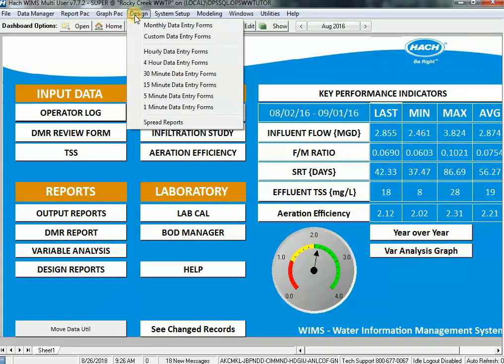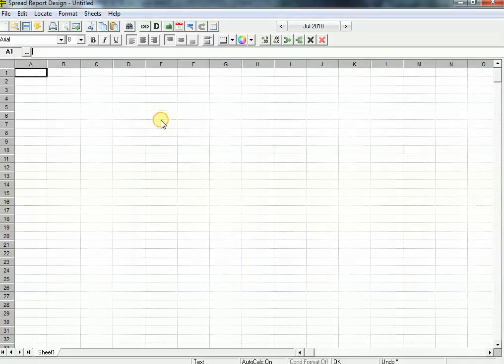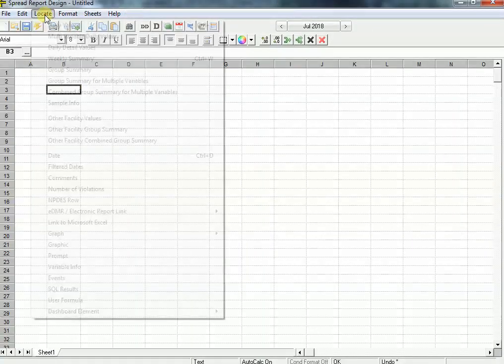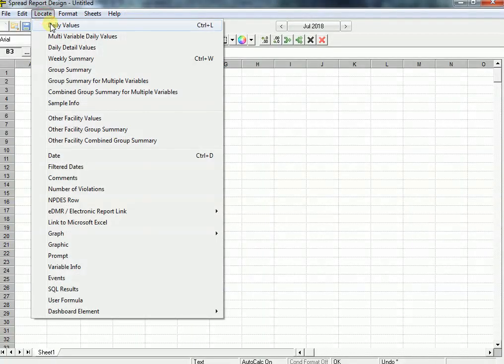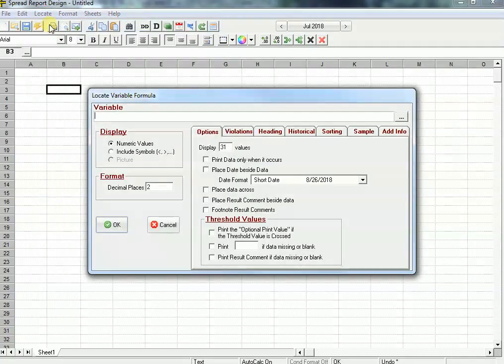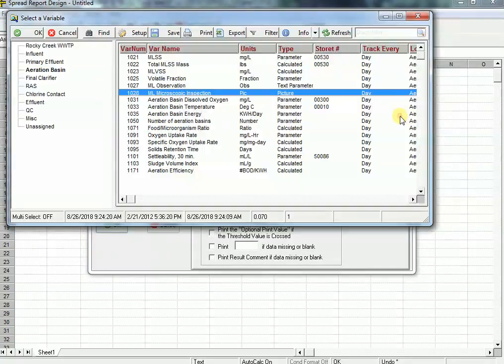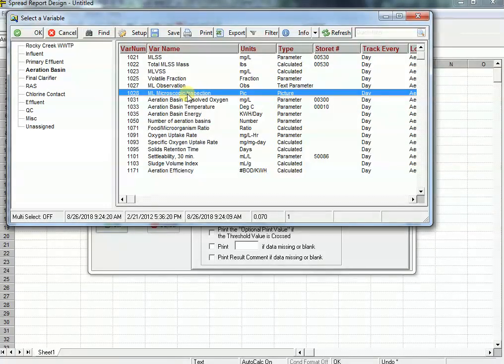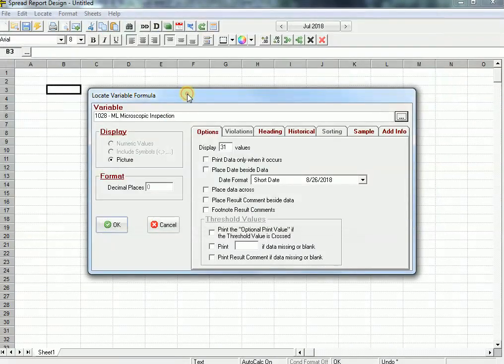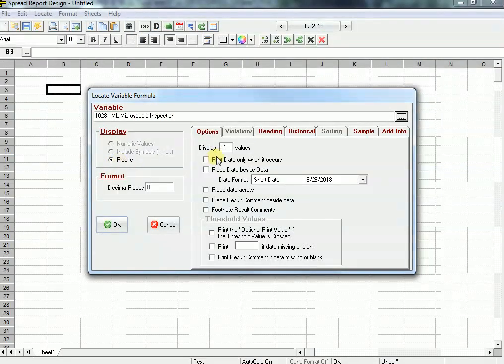Now the next thing you can do with it is output it in a report. Let's go ahead and design a spread report. I'm going to click in here. I'm going to locate daily values. You notice I have a picture type here. If I click my three dots and I pick this variable, it defaults to picture because it assumes that's what you want to do.